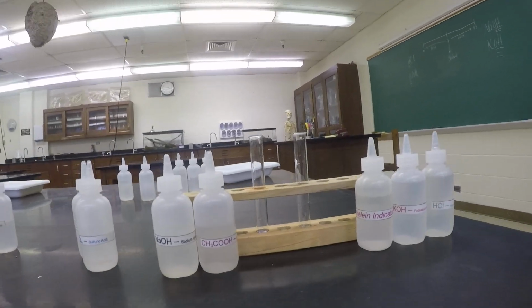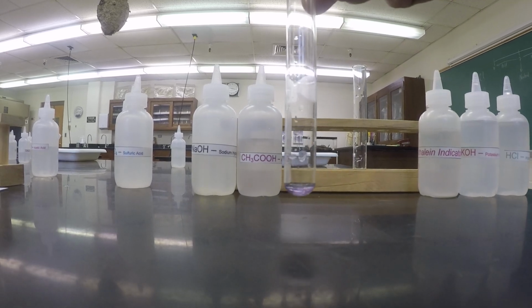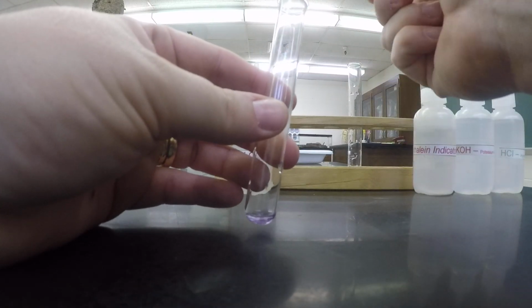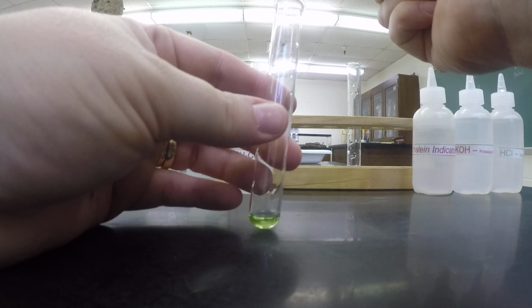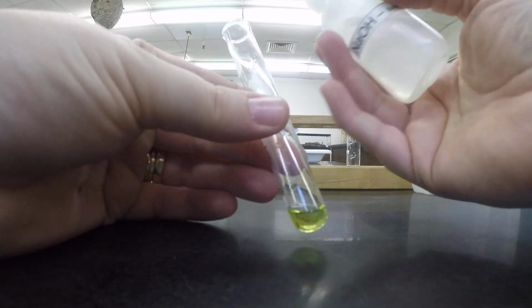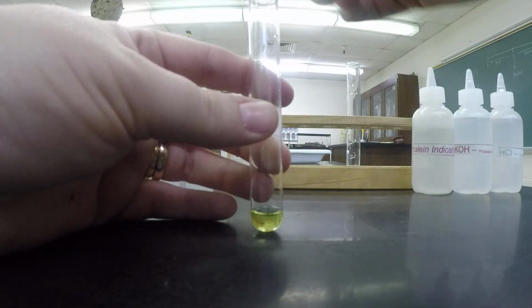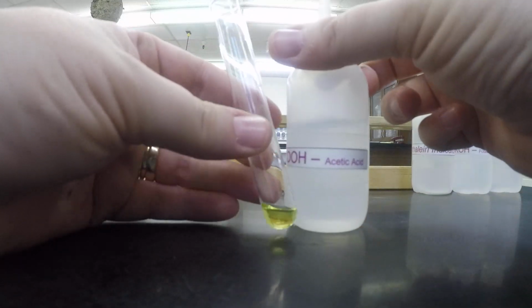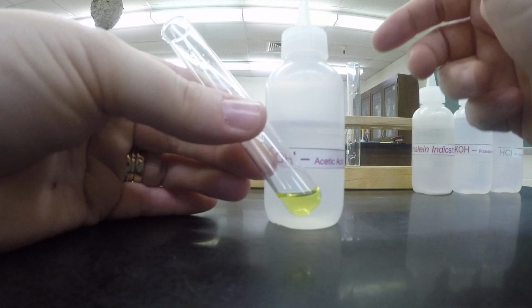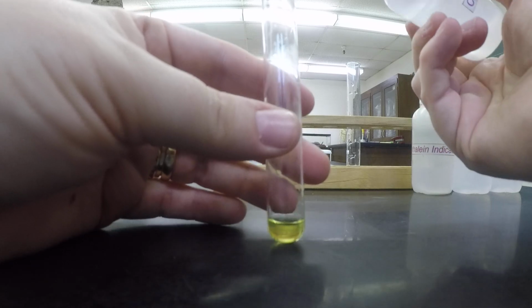Okay, so to start this off, I've already got my cabbage extract in this one. Okay, so I'm going to put 10 drops of sodium hydroxide into this. Okay, so you can see that it is a green color. All right, you guys can see that. Okay, so titration means I'm going to add 1 drop at a time of acid until this neutralizes. And when it neutralizes, there's a complete color change. And when there's a complete color change, that means that there is salt and water that is left.